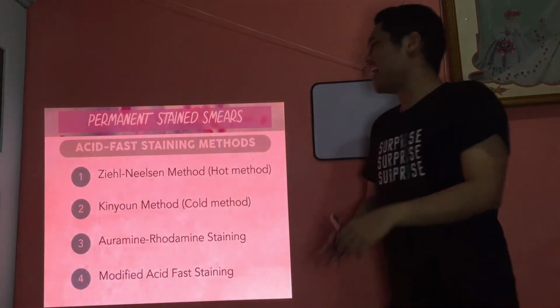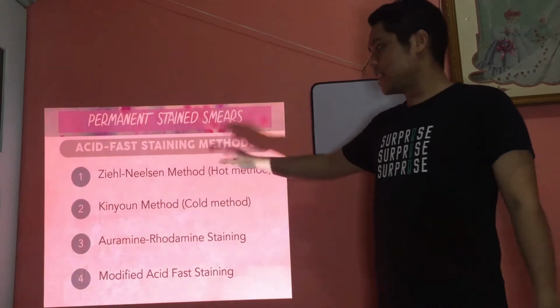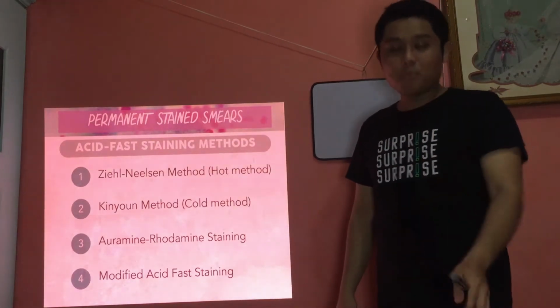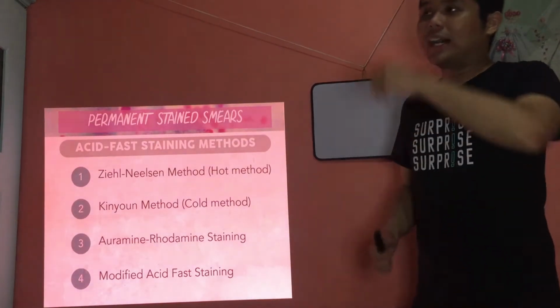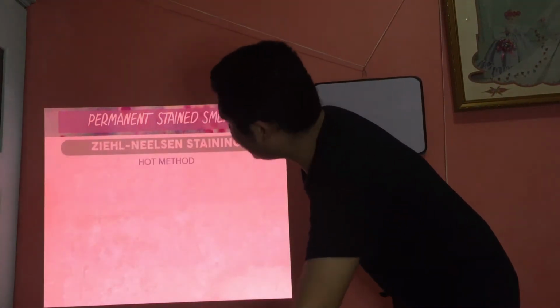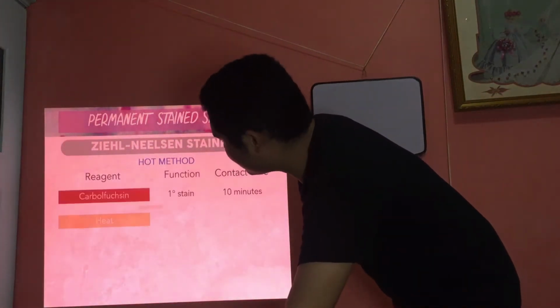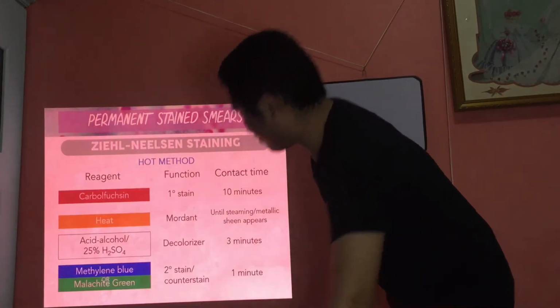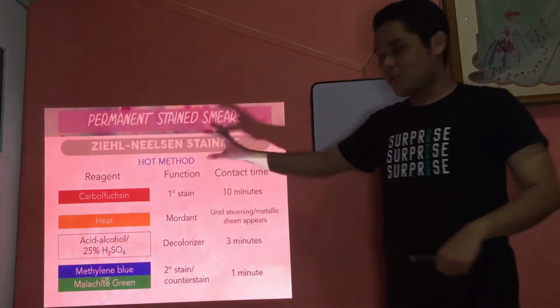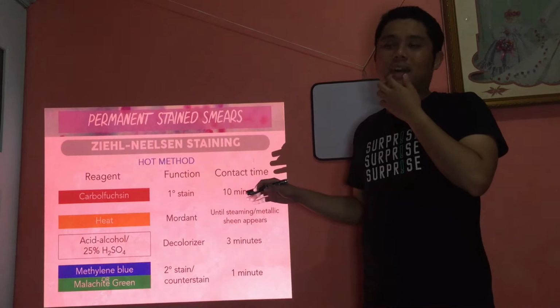Okay, alright. So we'll now go to the different staining methods, starting first with your Ziehl-Neelsen or hot method, which is again the most common method for acid-fast. But before that, we go to the different stains, the different reagents that we use. Now, these are the methods. These are the reagents. These parts are bacteriology na gyud.